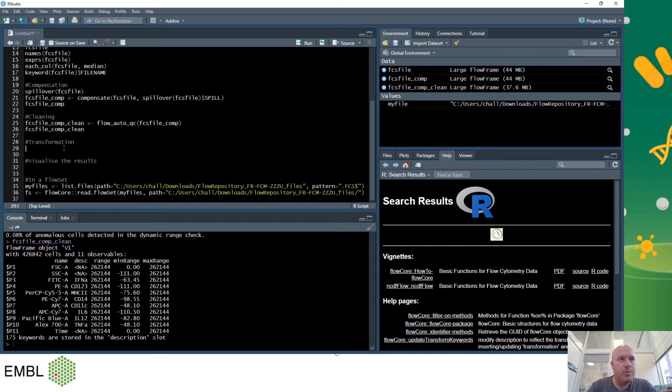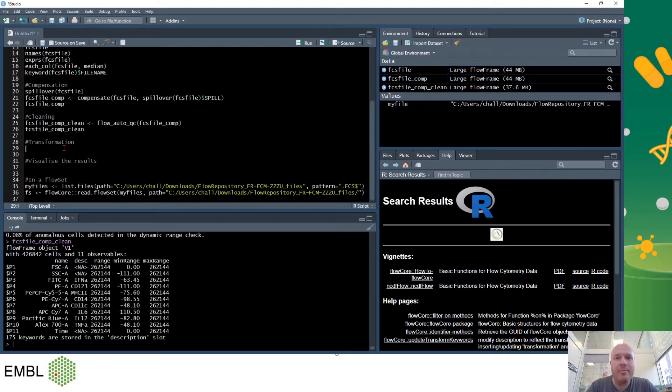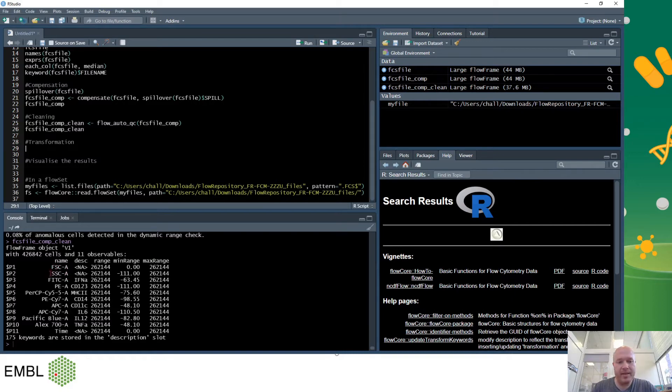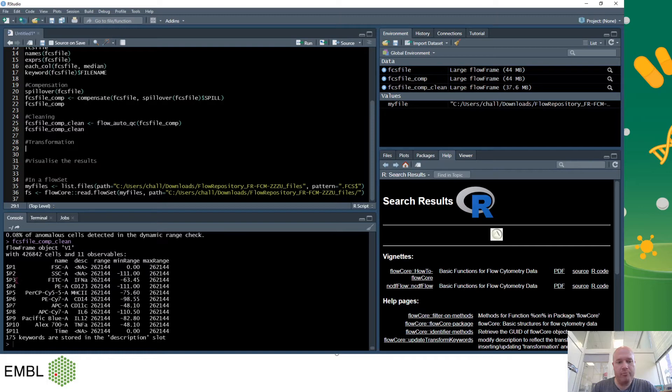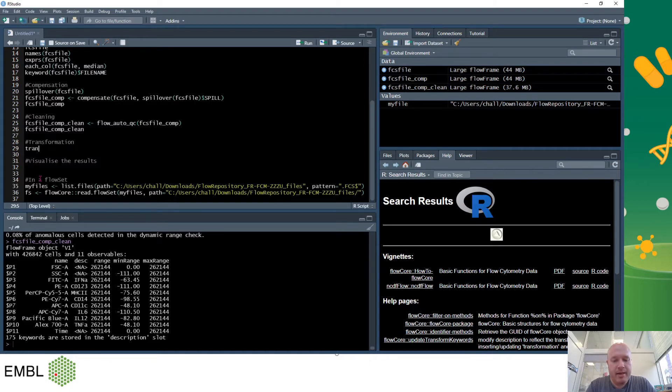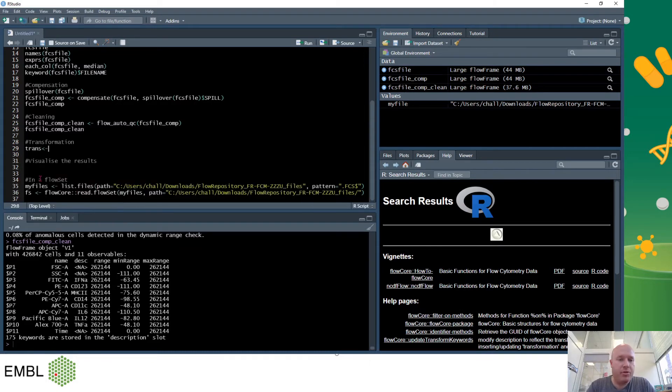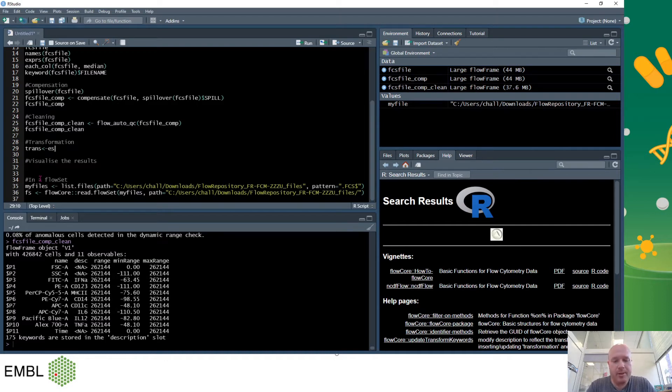So after removing the bad events we can now do data transformation. All the data saved in FCS files is linear but humans have a very hard time visualizing the dynamic range of linear data. So we want to move it into a logarithmic scale. On my FCS file I can see that my first two FSC and SSC should remain linear and the ones after should be logarithmic and time can remain linear. So I want to transform parameters 3 through 10. So to do this we use FlowCore again and what we want to do is produce transformation calculation. So we'll call this trans and we'll use the command estimate logical. I want to estimate logical of my FCS file comp clean but I only want to do certain columns.